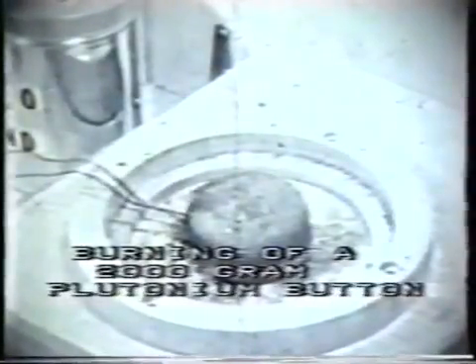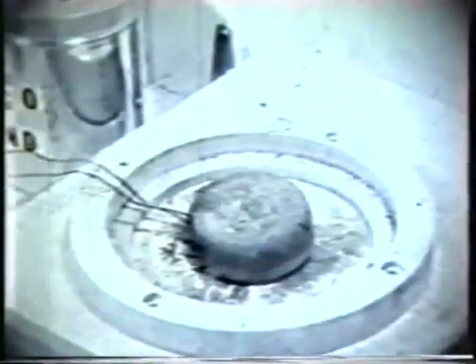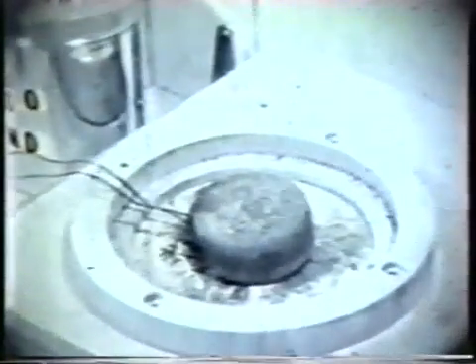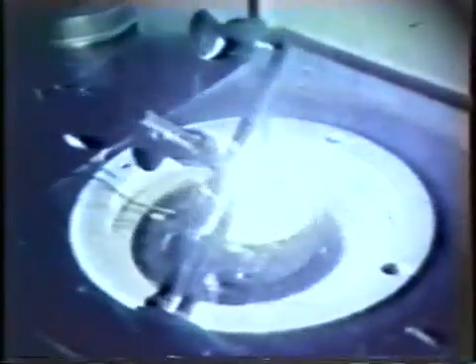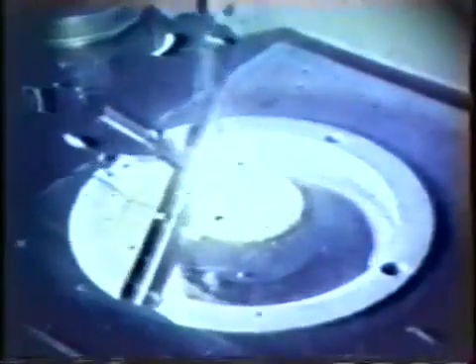This is the test with the 2000-gram plutonium metal button, with a thermocouple underneath it, all mounted on a transite surface which is non-combustible, surrounded by a rim for safety reasons. In order to ignite this larger piece of plutonium, a carbon arc torch was required — doing away with the notion that large metal buttons would ignite spontaneously from a small amount of heat. We actually had to apply several minutes of heating with the carbon arc torch before the metal would ignite.